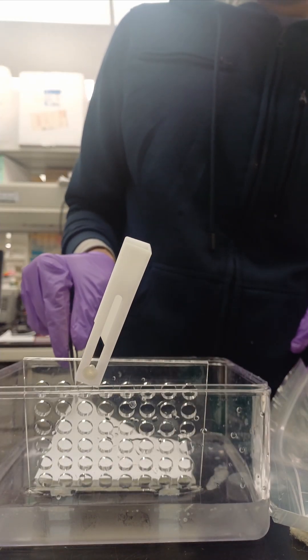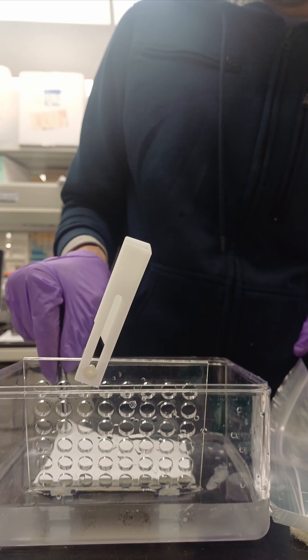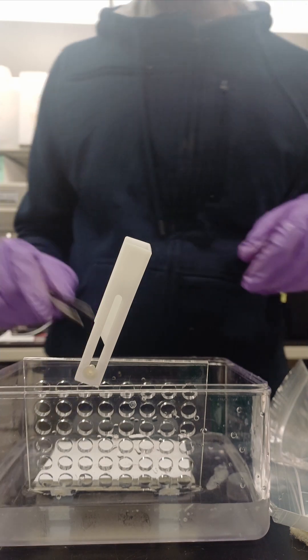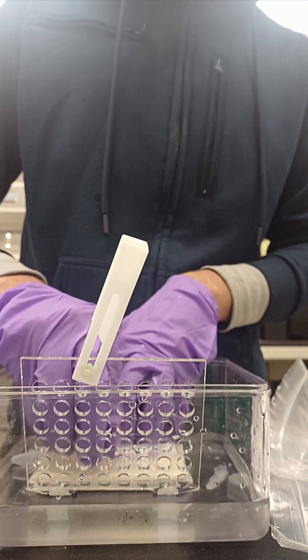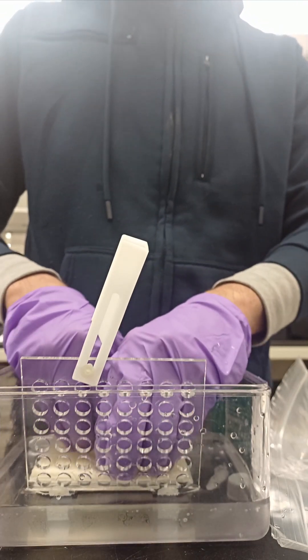Most important is to not touch the membrane directly even with gloves. Use a forcep and handle only at the edges. Layer at last again with filter paper and foam. Use a roller or a falcon tube to remove air bubbles. This step is super important.